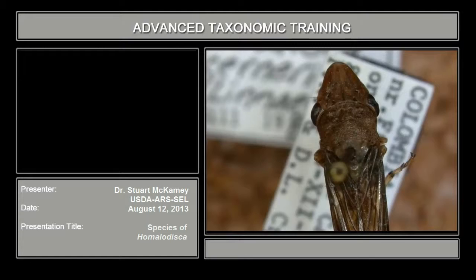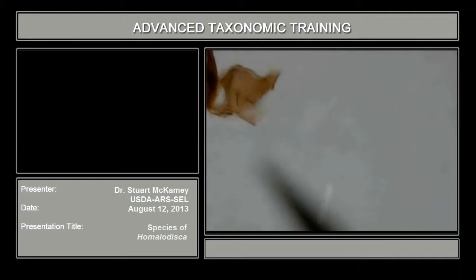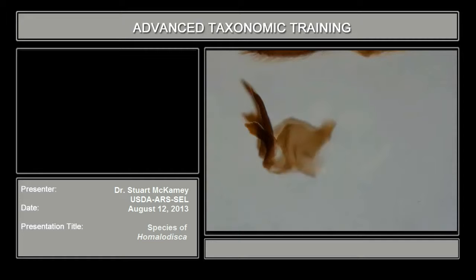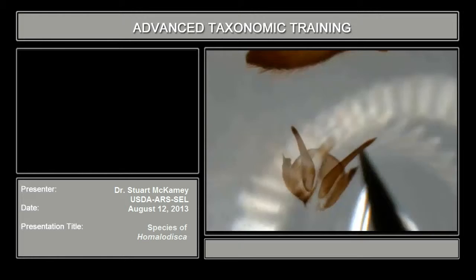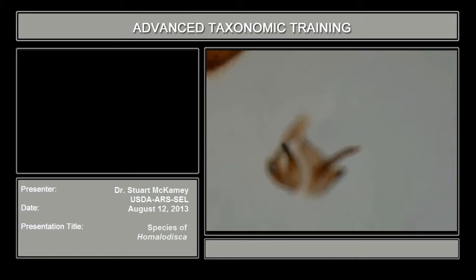This is the glassy-winged sharpshooter aedeagus. The posterior side is to your left, and it has two pairs of processes, which both arise ventrally. I'm going to turn this into a posterior view, which is the important view for this series. You can see they both arise ventrally — both pairs arise ventrally.